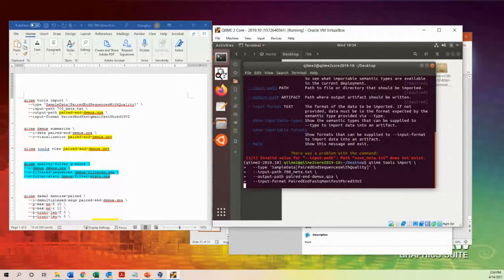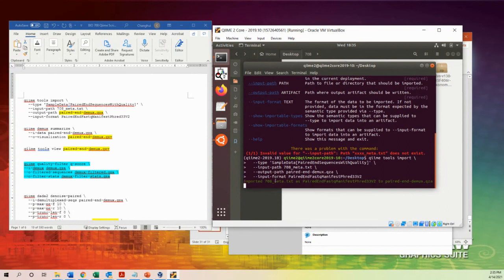And then they will perform this demultiplex. And it should be very quick. But since I already did this, they probably are confused that I have the file. But it's okay. They still finished. Did you get this green line here?